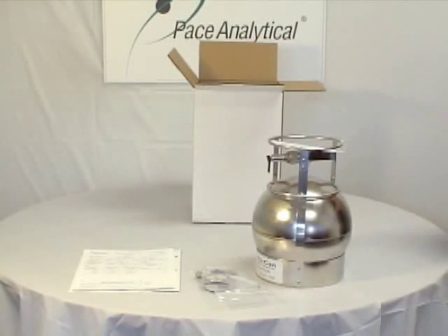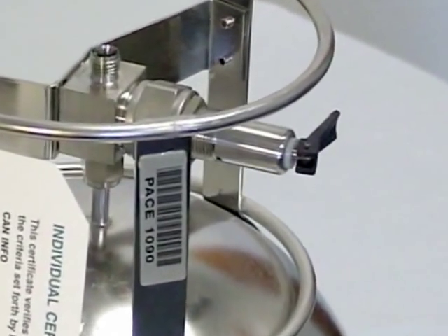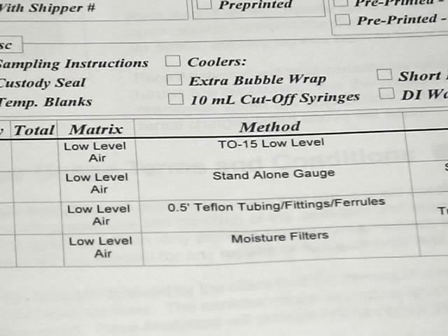Now that you have removed the contents of the box, you will need to do a thorough inspection of all parts received. Please do not attempt to open the valve on the can until you are ready to sample. We will get to that in great detail later in this video.